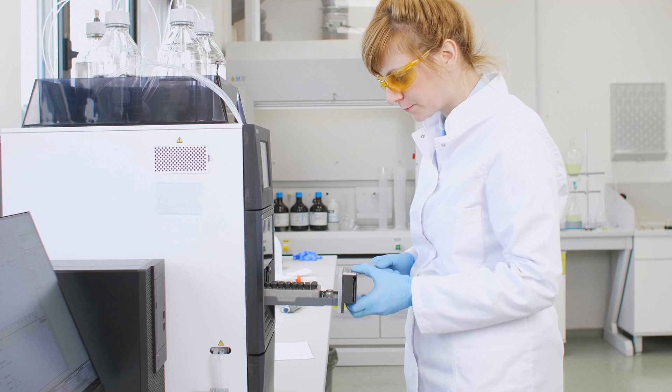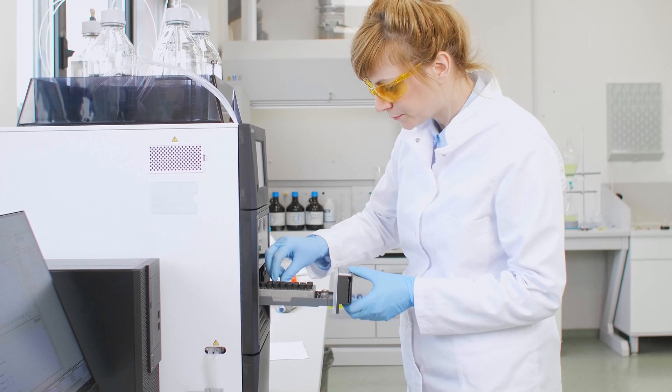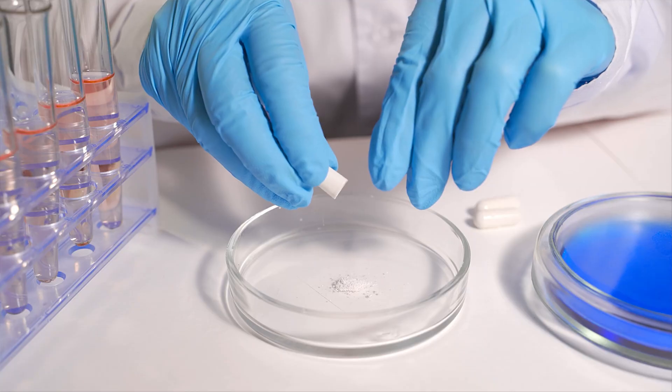Forensic scientists use chromatography to detect false documents by looking at colours present in inks. It's also an important technique for testing unknown substances in food and drink. And in medicine, chromatography plays an important role looking at purity and safety of drugs.